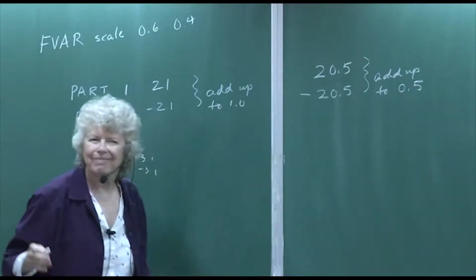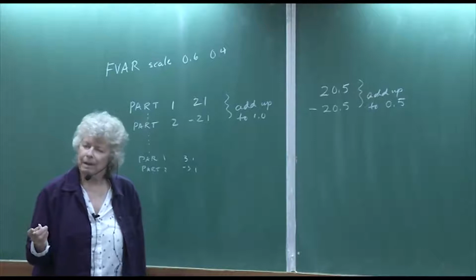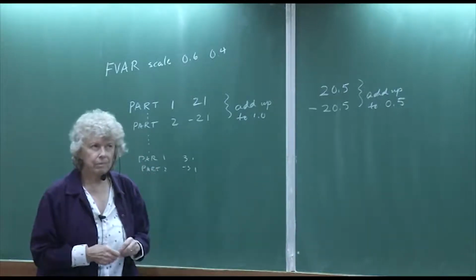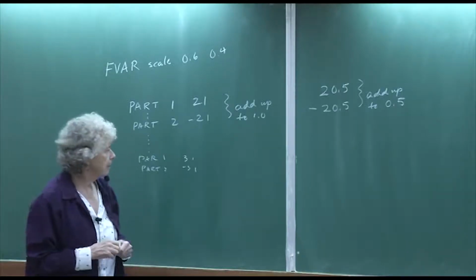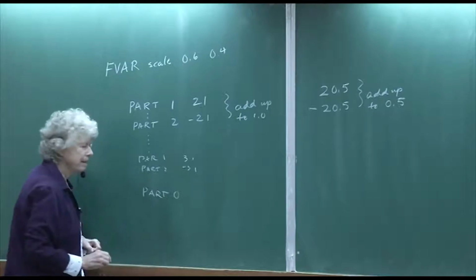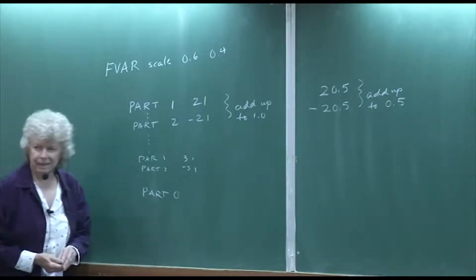It's just the way that the program was written. I know it's a little confusing. It certainly confuses a lot of people at the beginning. But I think I uploaded the SHELX guide that originally talks about this, and also the PDF file. If you go to part, it explains some of this too. And don't forget that you have to end with part 0 to cancel out this part stuff. Otherwise, you're going to be refining the rest of your atoms with the wrong occupancies.